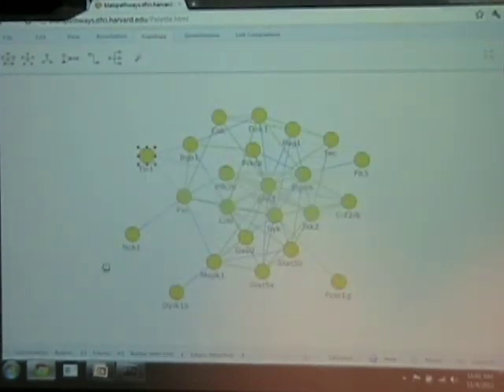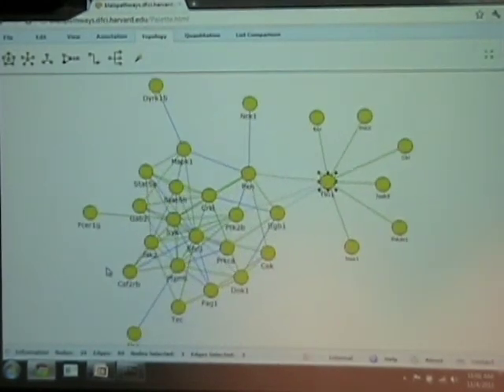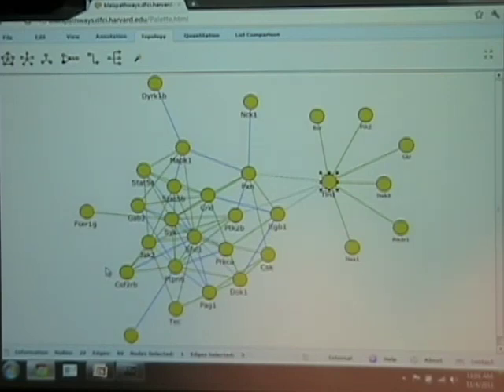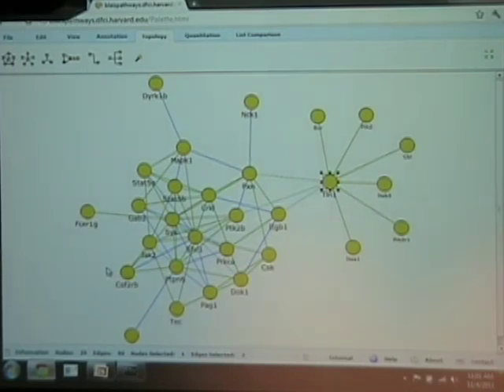So you can expand out to proteins that you didn't see. Then you would want to get their sequence, predict the mass, go to the raw file, and make an XIC to see whether the peptide was there. And so you saw how you can match the XIC, and so it would be pretty straightforward to make a tool which uses this to do some context research, then makes the relevant URL and hits the raw file if the raw file is exposed this way. So I think that's sort of where this is going a little bit.